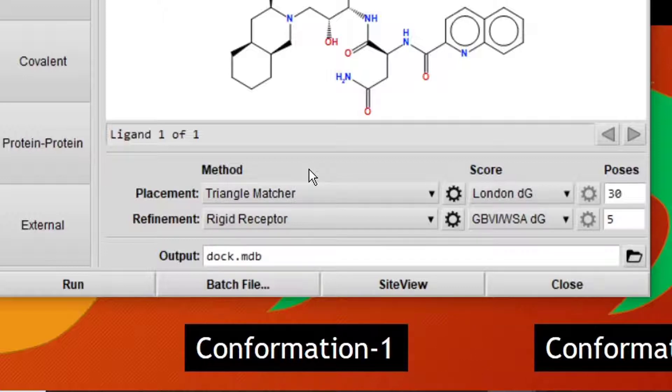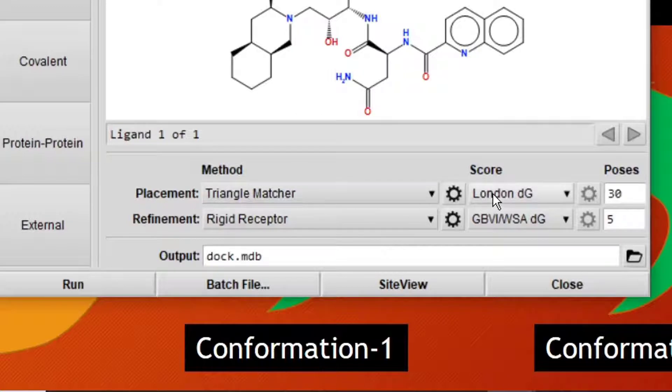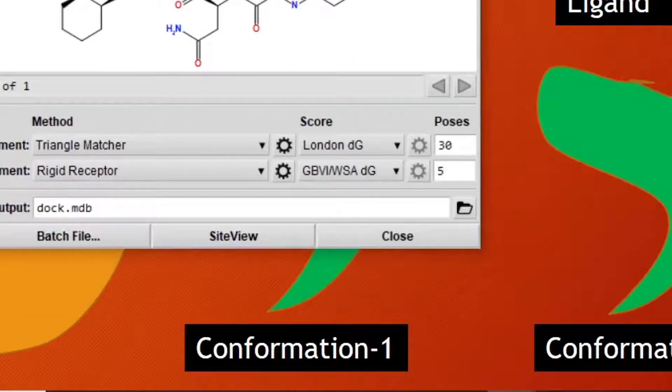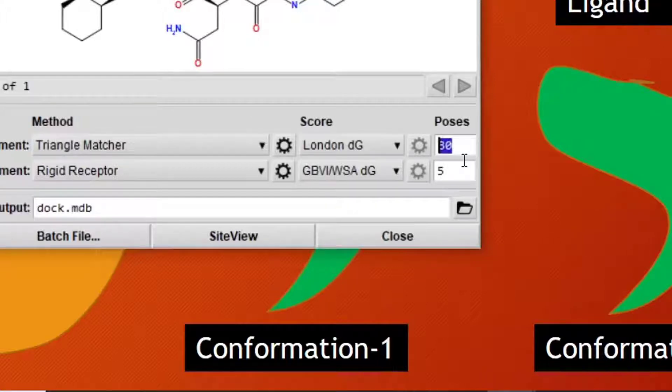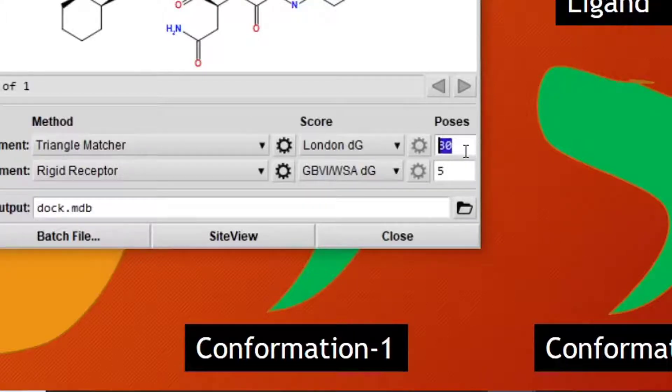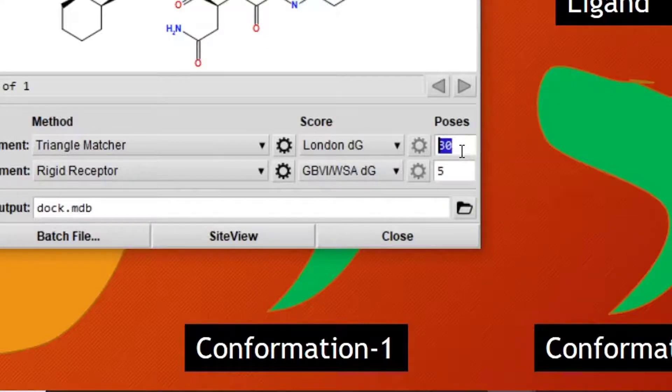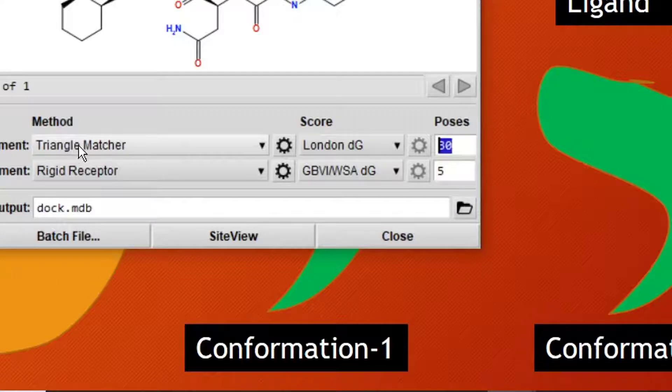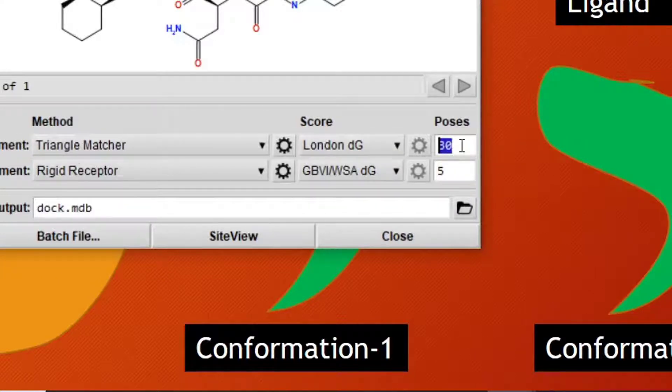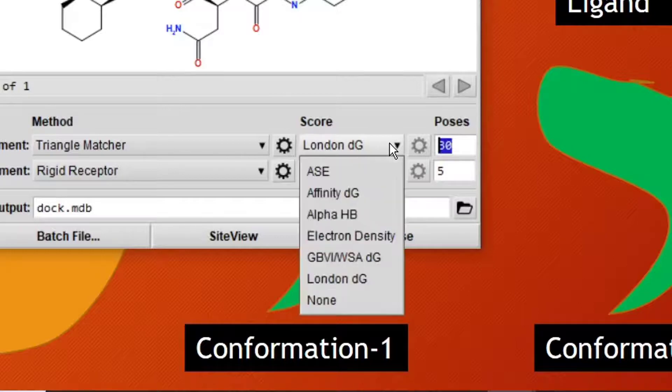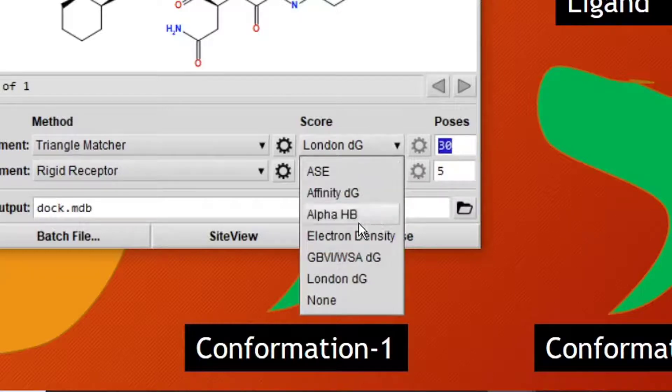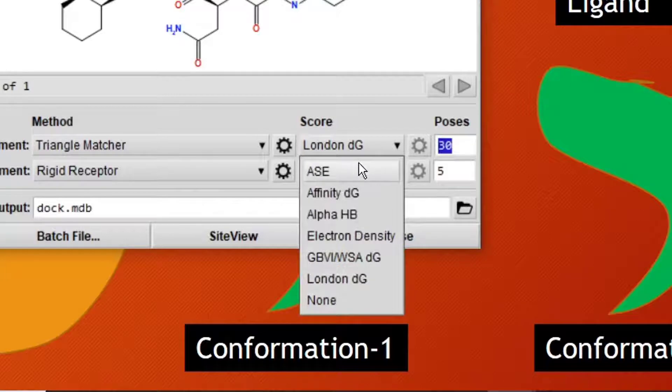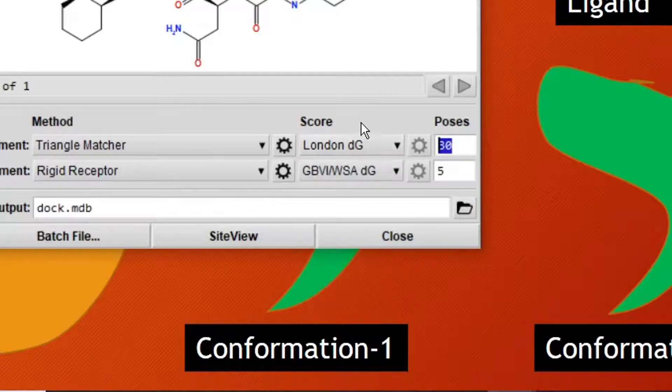After placement, 30 poses will be generated using Triangle Matcher placement method. Then it will score all these 30 conformations using London DG scoring function. There are different scoring functions, but for this purpose we will use London DG scoring function.